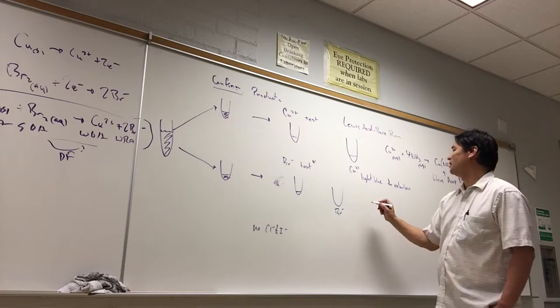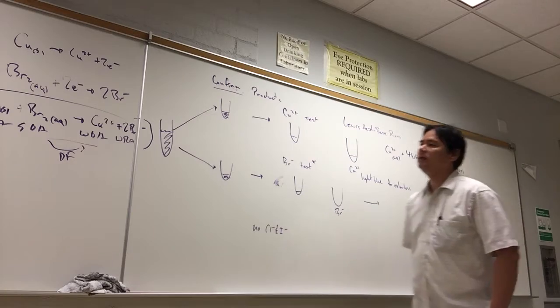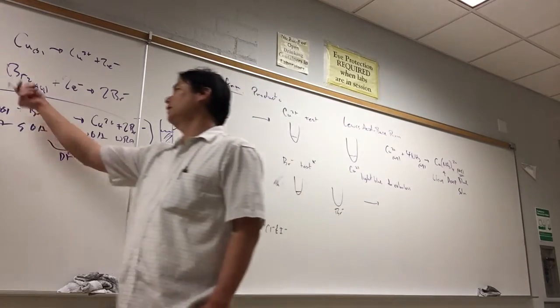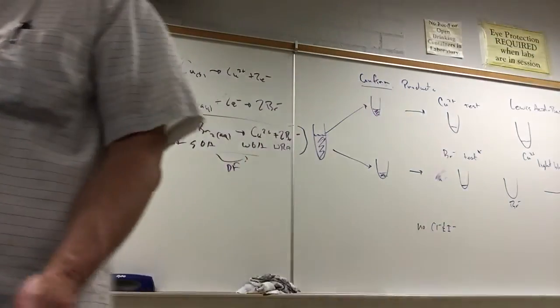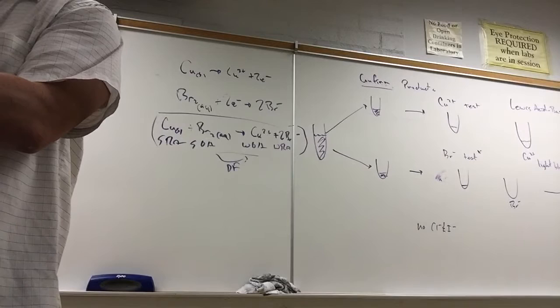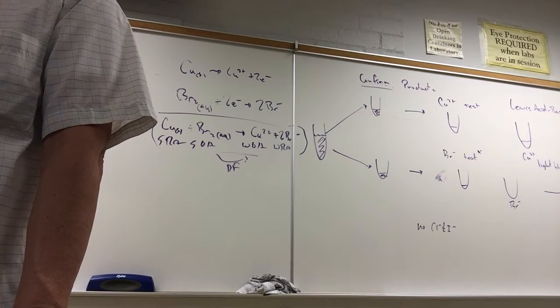We add silver nitrate. Now, silver nitrate, you have to watch out. Bromine, you have to watch out. I remember I was in an organic lab, and bromine's used as an oxidizer all the time. It's a pretty decent oxidizer. And one of the students spilled a drop of bromine on their thumb and started to panic because they thought, you know.